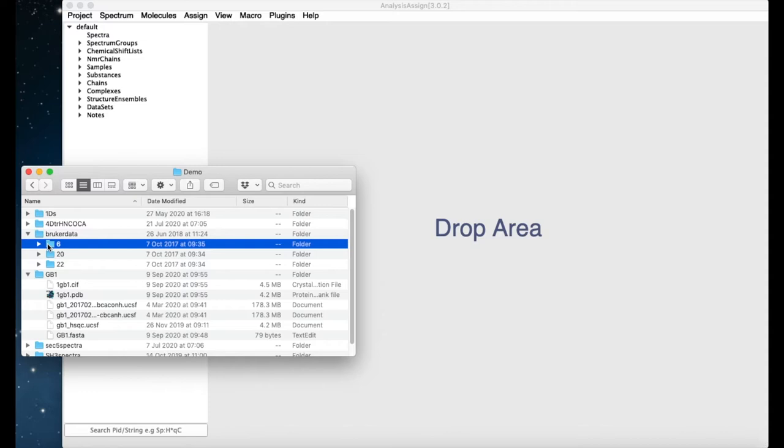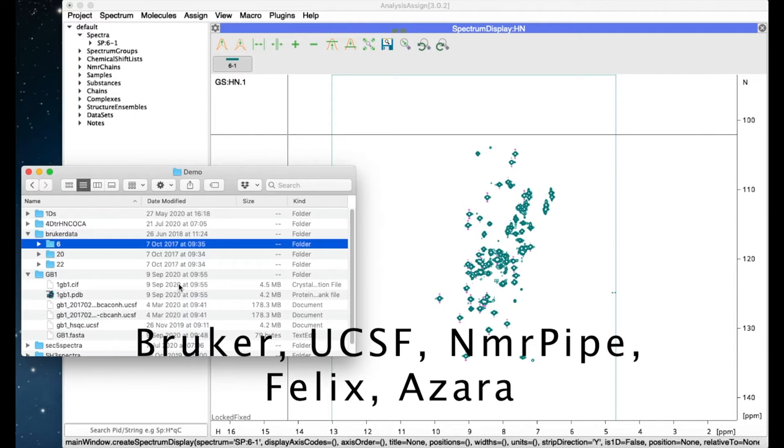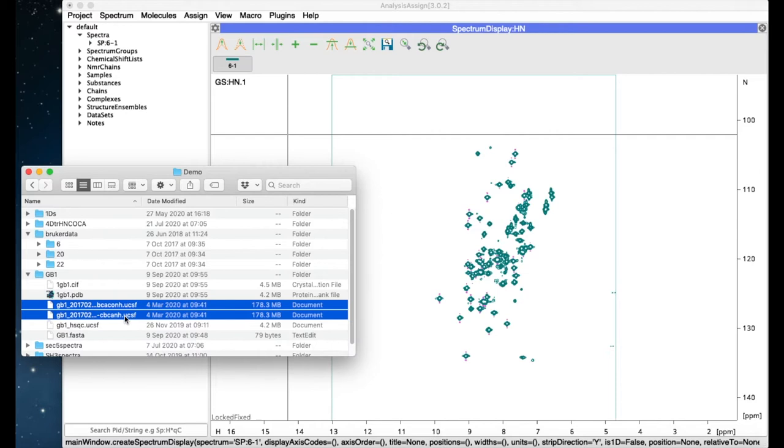But we can read lots of other formats as well, such as UCSF, Varian NMRPipe, Felix, or Azara. Simply take one or more files and drag them into the project.